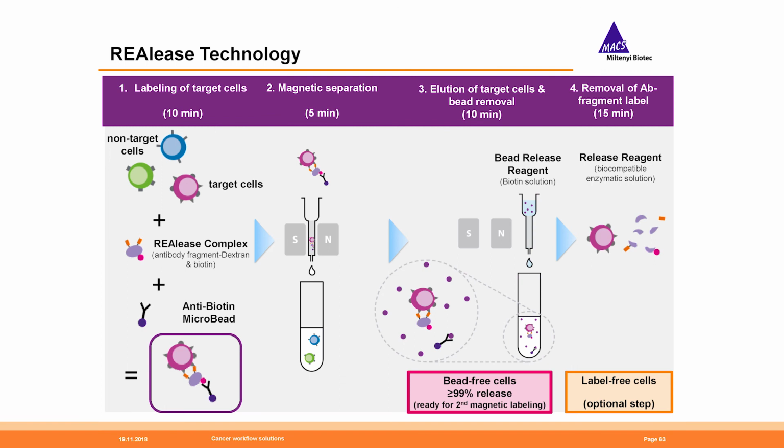So that would mean you'd have your, let's say, CD4s, and those you can right away put a CD25 marker on, and you have your Tregs that were in your initial tumor. Had you taken the CD25s right away at the beginning, you would have never identified them because they are such a small target population.